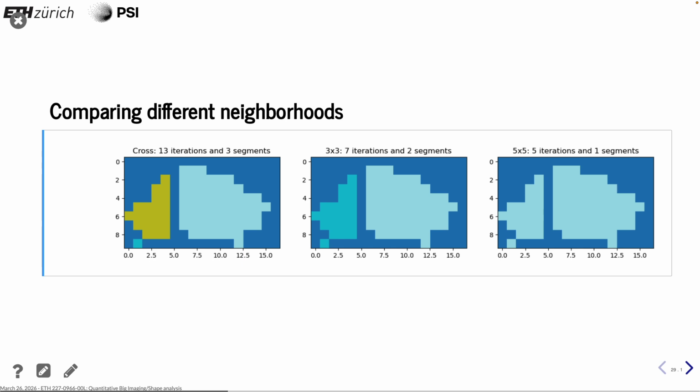Which kind of neighborhood you use depends on what makes sense in your evaluation. But I would tend to only use these 2. That one is a little bit more exaggeration and exotic, I would guess. There would be other methods to link these objects together.